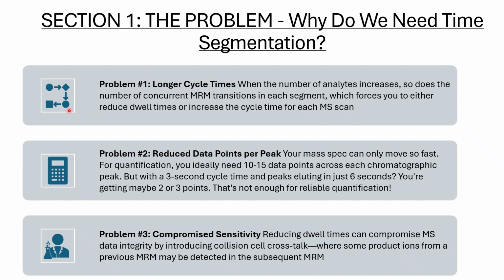Problem 1. Longer cycle time. When the number of analytes increases, so does the number of concurrent MRM transitions in each segment, which forces you to either reduce your dwell time or increase the cycle time for each MS scan.